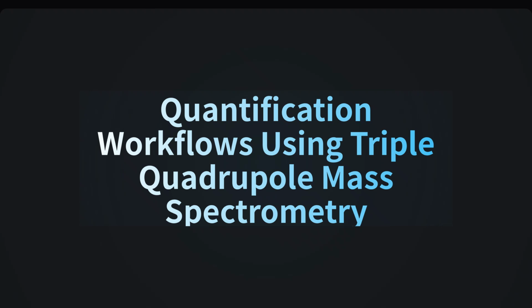Hello, everyone. Today I'll walk you through the quantification workflows using Triple Quadrupole Mass Spectrometry. In many scientific fields, detecting a molecule is not enough. We often need to know exactly how much of that molecule is present in a complex sample. This could be a drug in human blood, a biomarker in clinical samples, or a pesticide in food. Triple Quadrupole Mass Spectrometry has become one of the most reliable technologies for achieving highly accurate and sensitive quantitative measurements.